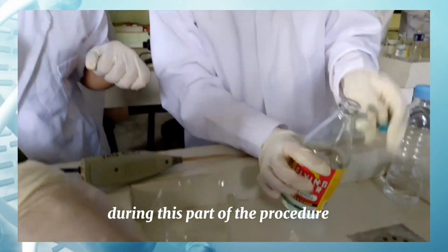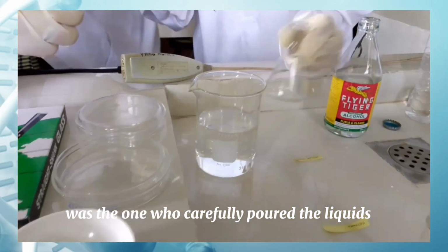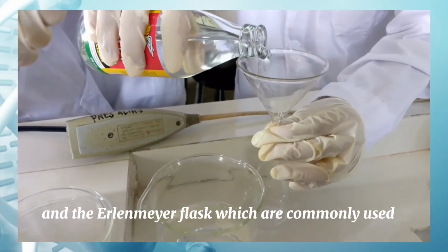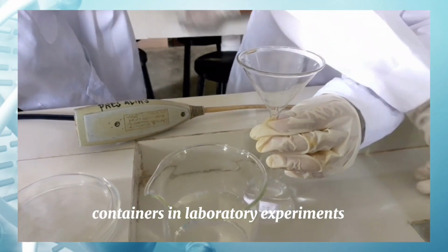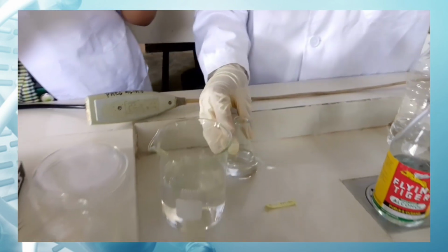During this part of the procedure, my groupmate was the one who carefully poured the liquids into the laboratory glassware. He placed the liquids into the beaker and the Erlenmeyer flask, which are commonly used containers in laboratory experiments for holding and mixing solutions.